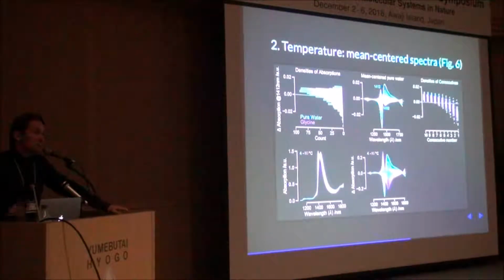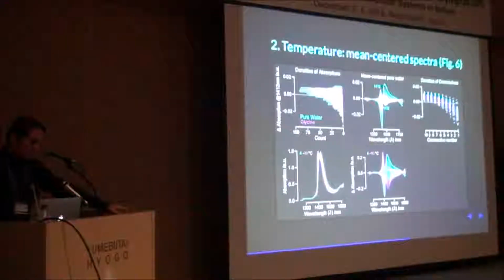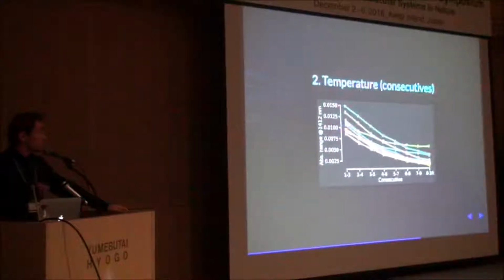And this story really goes much deeper, because even a small temperature change generates spectra as much as solutes. So it will generate wavelength shifts. This is a topic that I'm not completely clear on in terms of the physical origin, because they do overlap in some way. But let's move on. There is a point at the end.